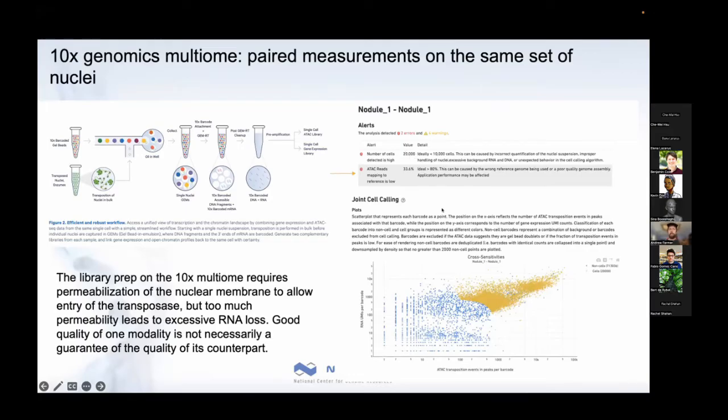And furthermore, in some contexts, you can see that I've got an unrealistically high number of nuclei that Cell Ranger called, 20,000, which is the highest number it will call. This actually happened after I added organelle representation to my reference. So there are a lot of weird things that can happen in terms of the cell calling, at least using the standard methods provided by the 10x tools. And you'll also see here, we're dealing now with soybean nodule data, and I have a really low number of reads that are mapping to the reference.